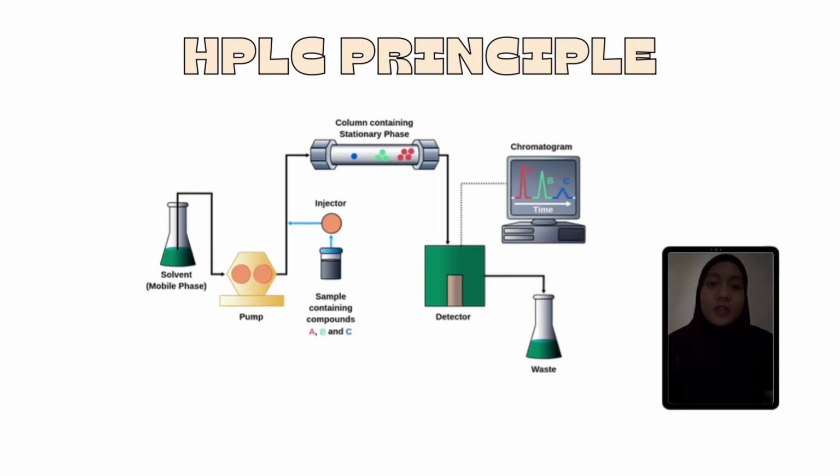So this is an example of an HPLC block diagram. The purification takes place in a separation column between a stationary and a mobile phase. The stationary phase is a granular material with very small porous particles in a separation column. The mobile phase, on the other hand, is a solvent or solvent mixture which is forced at high pressure through the separation column. Via a valve with a connected sample loop or a small tube of stainless steel, the sample is injected into the mobile phase flow from the pump to the separation column using a syringe.